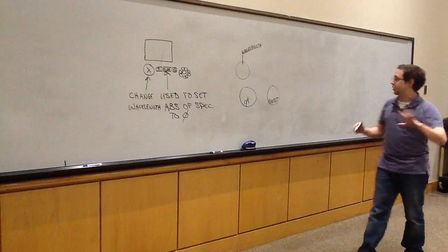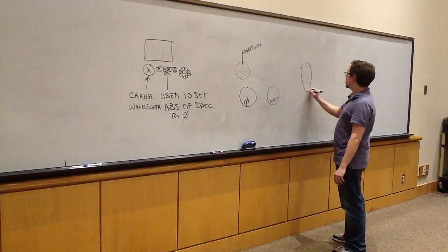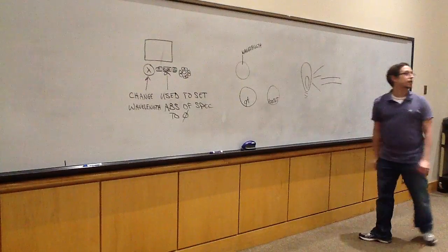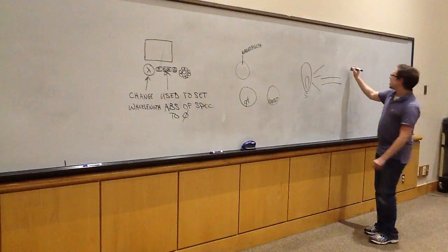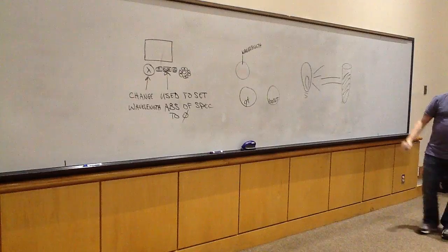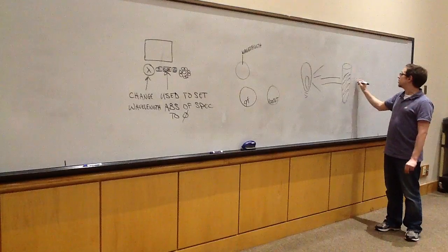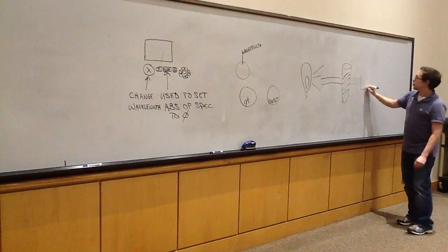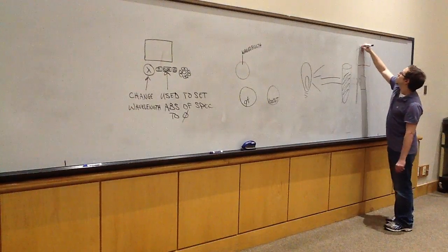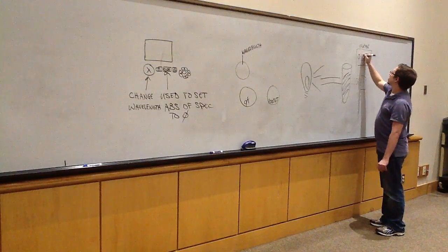The big thing here is the general idea of what the spectrophotometer is doing. Okay? So inside the spectrophotometer, we have a light bulb. And that light bulb, not surprisingly, is emitting light. You're going to take a sample of whatever you're measuring. You're going to place it into the spectrophotometer, and as the light hits that substance, some of the light is going to pass through it and go to a meter that's going to measure it and give us a readout. Okay, so here is our meter with our digital display, and it's going to give some form of readout in terms of absorbance.